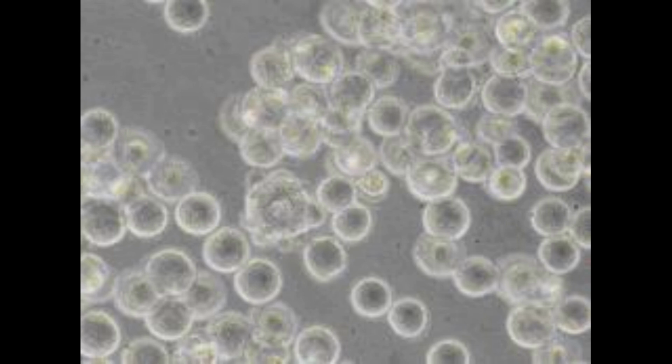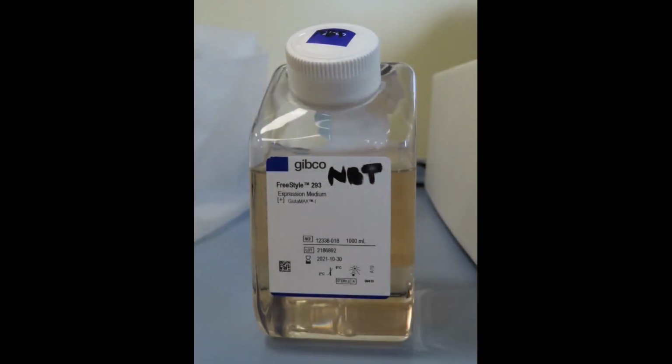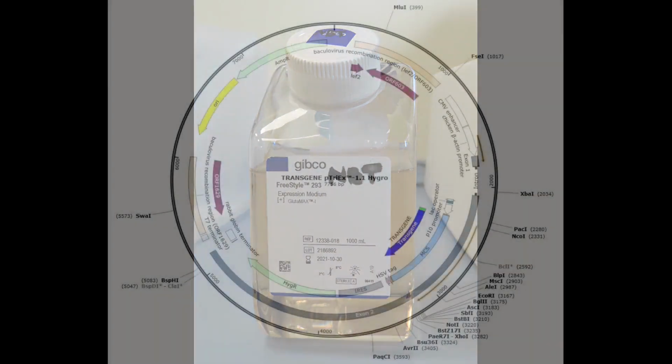These cells are adapted to grow at high cell densities and have a very high transfection efficacy in large volumes. The serum-free expression medium FreeStyle 293 is used for cell growth, and at the same time is suitable to perform the transfection, avoiding in this way having to change the medium.